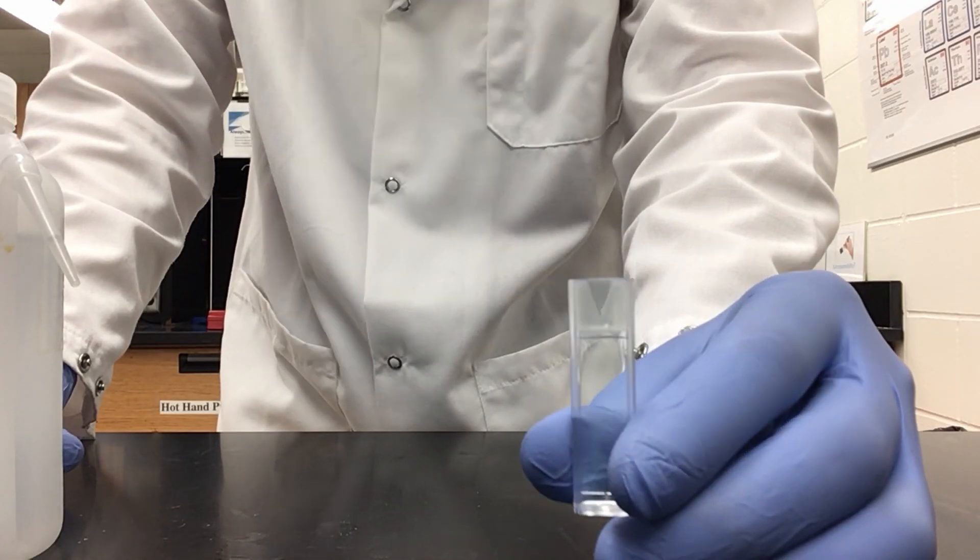Our next solution is going to be our tetrachlorocobalt anion. It is too concentrated as it stands, so we need to dilute it in order to measure absorbance. I will pour out some of our cobalt into my beaker, then dilute it using isopropanol or 2-propanol. Our dilution is going to be 10 parts isopropanol with one part of our cobalt complex. So I will take 1 milliliter of cobalt, transfer to my beaker, dilute with 10 milliliters of isopropanol, and swirl to mix. Our original solution is a very dark deep blue or violet; our diluted solution is a nice light blue. I will pour that into our cuvette.